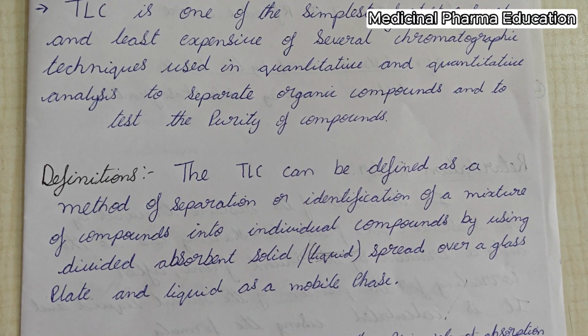I hope you have done your TLC experiment in your B.Pharm. There is a test also, right? In the TLC plate, you identify it based upon the spots. It is also there in M.Pharm.